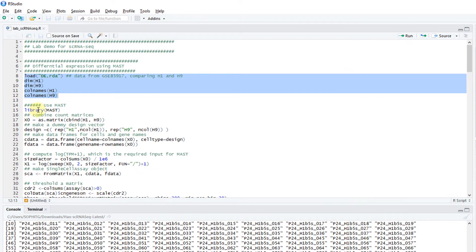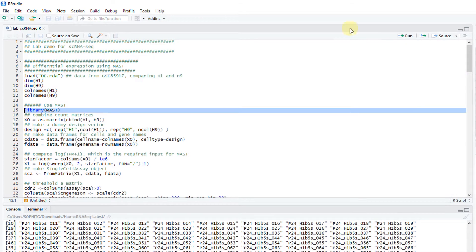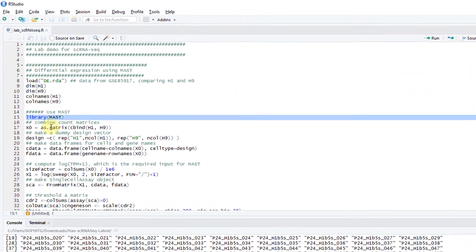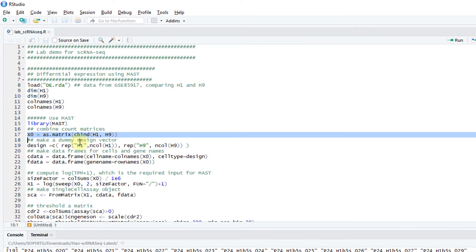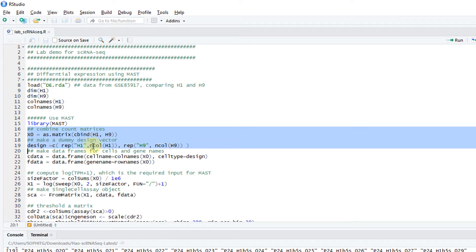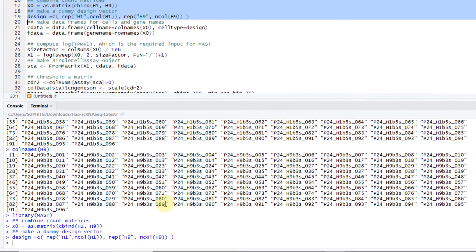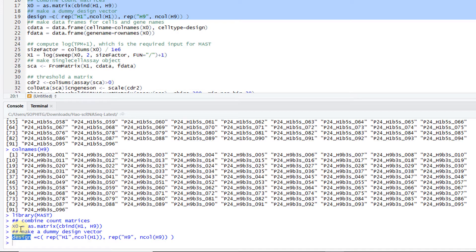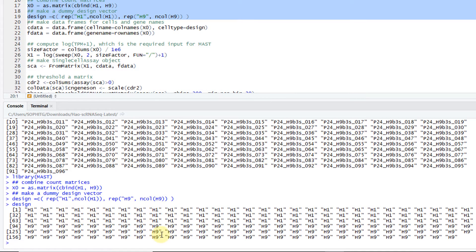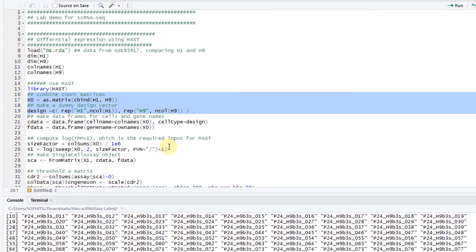Now let's run MAST. I first need to load in MAST. Then I need to combine the count matrices from these two conditions and make a dummy design vector. The design looks like this. It's just a vector indicating the experimental conditions, H1 and H9.